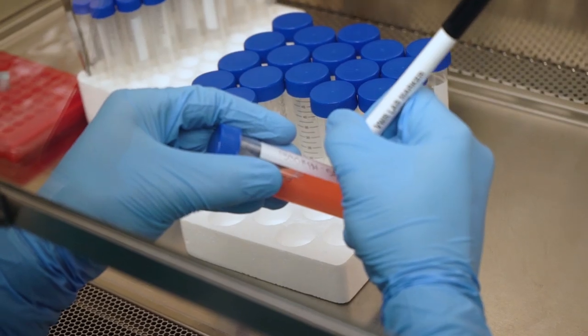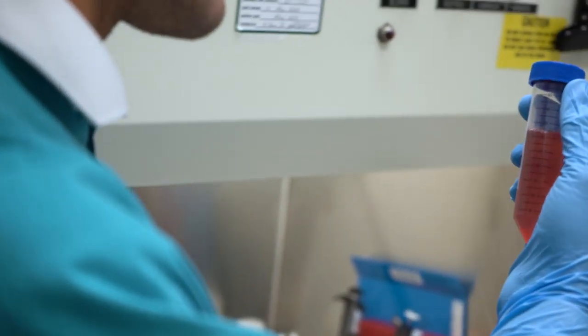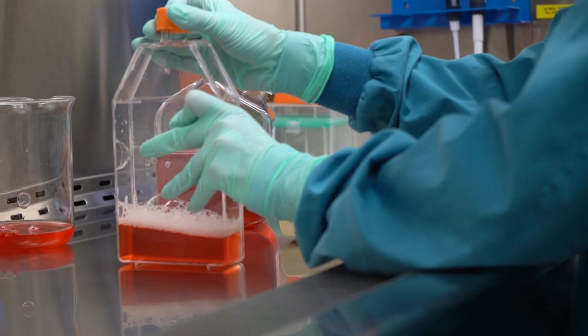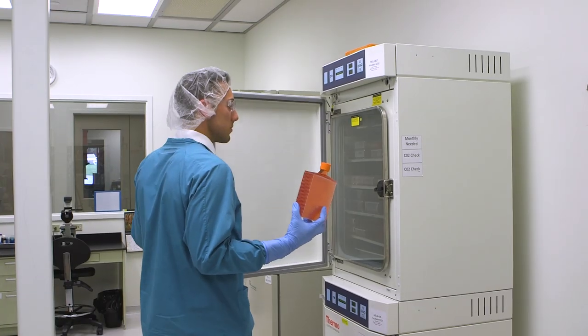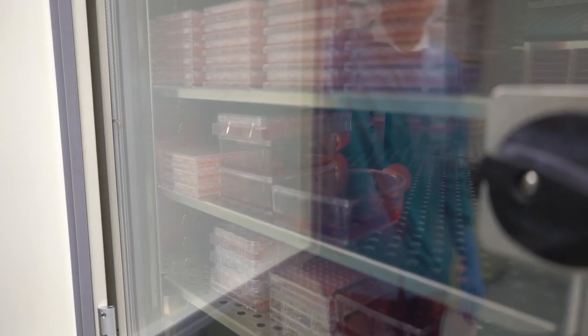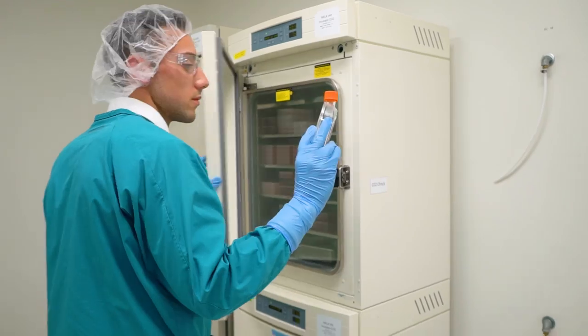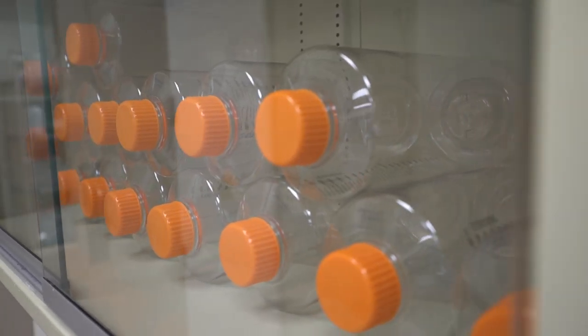There are guidelines in place for each step of the process from the communication with the project managers and the clients all the way down to the technician. Technicians solely take on these projects having the information from project management from our clients in order to successfully take a monoclonal from point A to the end of completion individually taking care of each clone throughout.